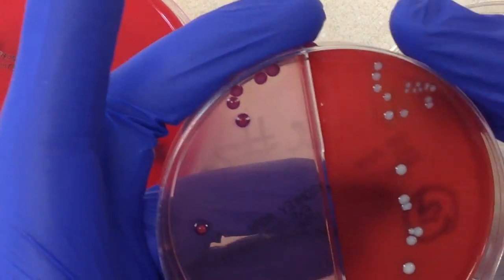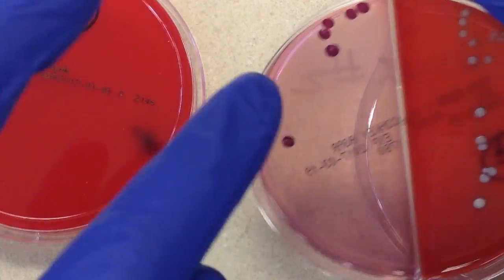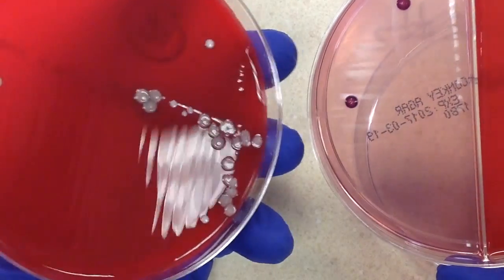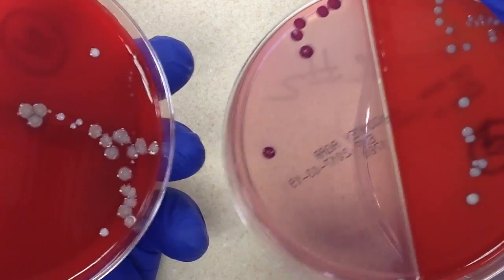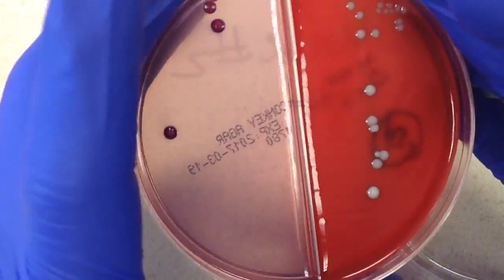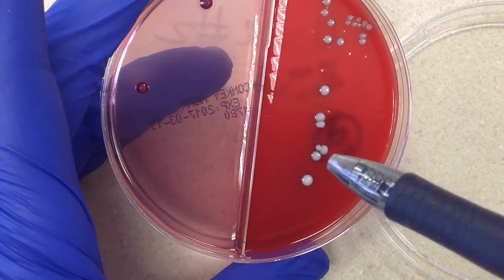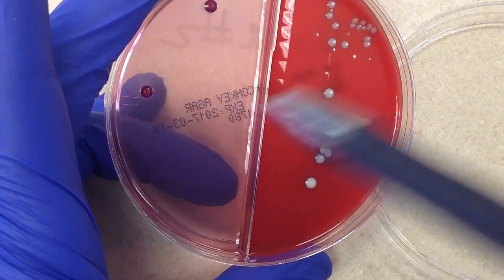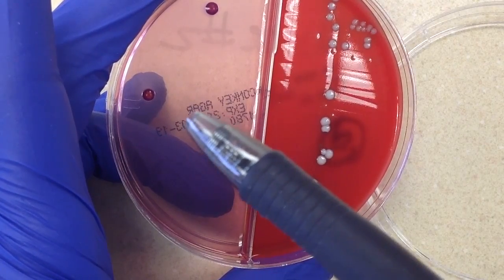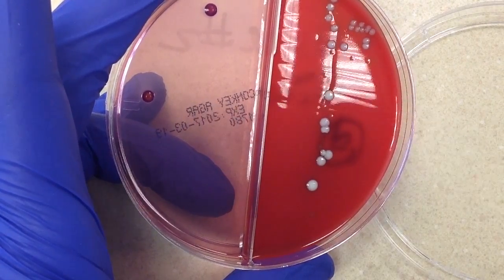On our McConkey's, we have these lactose-positive, or lactose-fermenting, colonies. They might be these gray ones over here. But one thing I can tell you for sure is none of these colonies are those colonies — that's impossible, because this is our CNA and the gram negatives would never grow over here.